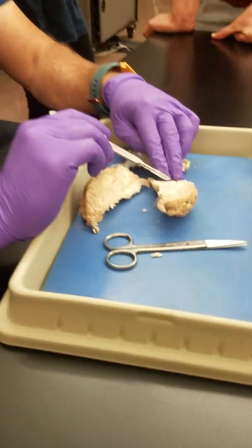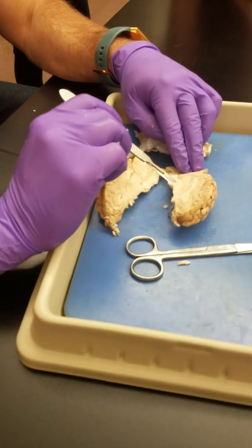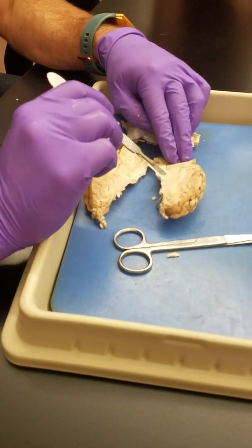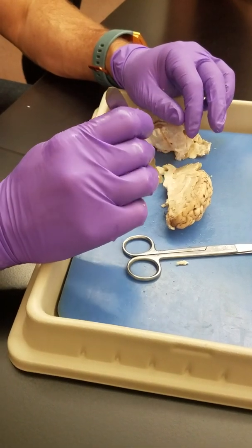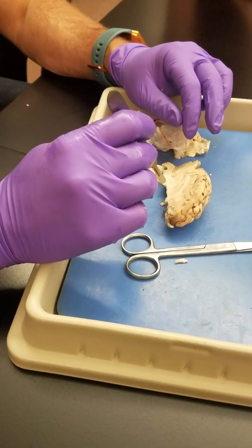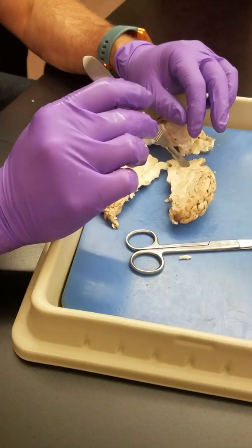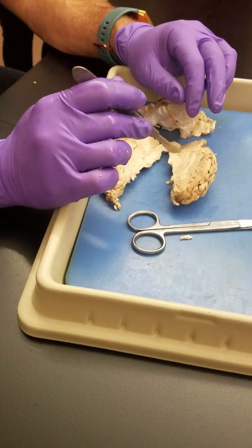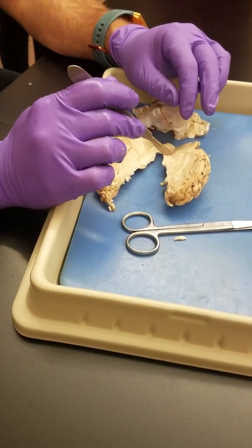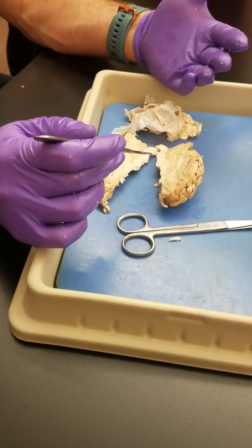Here you can see the thalamus. So here, this big thing here, is the thalamus. Right below it is the hypothalamus. Again, the hypothalamus is where we control all of our drives like hunger, thirst, things like that. Also where we regulate temperature. The thalamus, again, is the central relay station. All of the incoming sensory information except for smell first goes to the thalamus, and then from the thalamus, it goes to the appropriate association area in the brain.